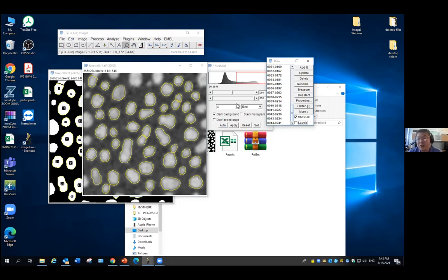Which algorithm you choose, which number you choose, whether you do watershed or not, what kind of size limit you use to exclude the smaller white objects, that's your choice. You can play around on multiple of your images. You should play around with multiple images to get the protocol. But once it's set, you have to follow exactly the same protocol to analyze all your images. And then you can compare those results. Okay? So it's always consistent. We treat all the images the same.